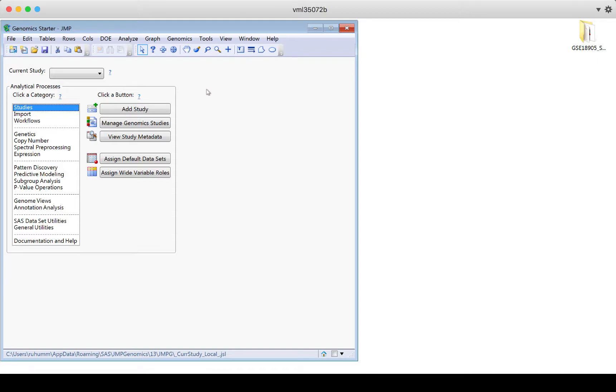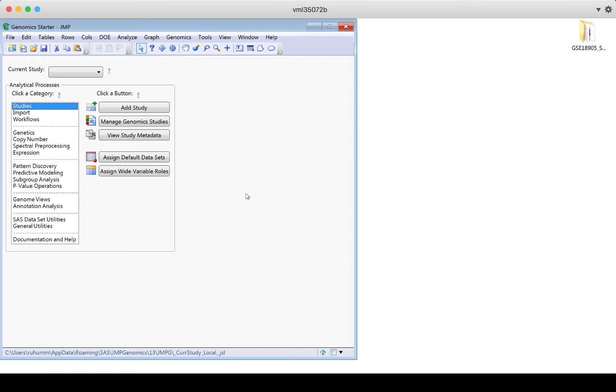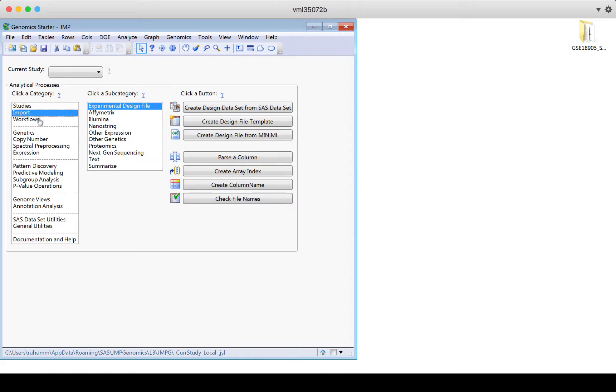In this video, I'll briefly discuss getting started using the JMP Genomics Starter. I have the starter open here on my desktop, and the way you use this genomics starter is by choosing the category and then the subcategory that you want to use.